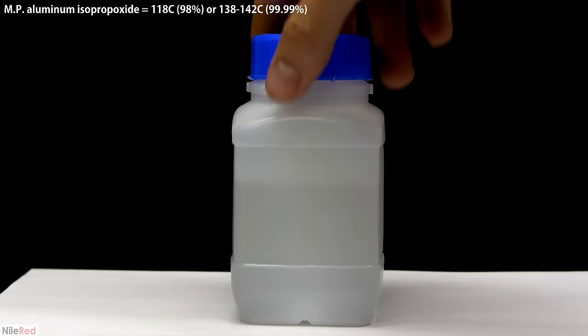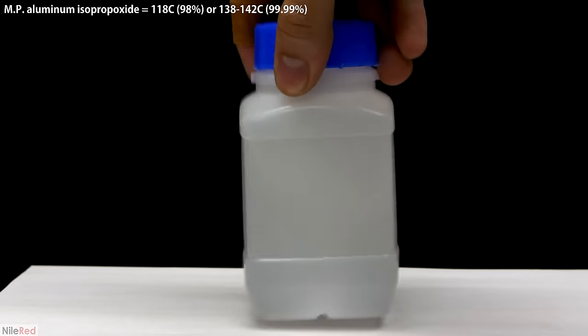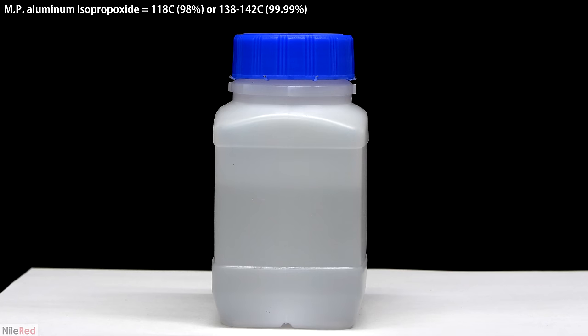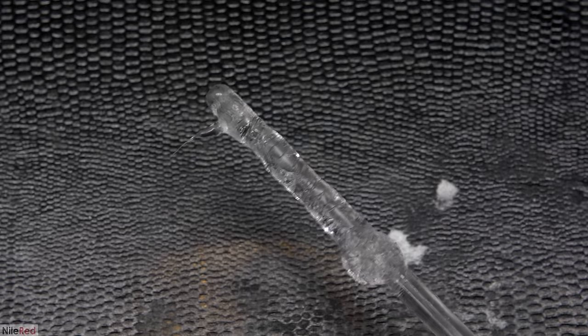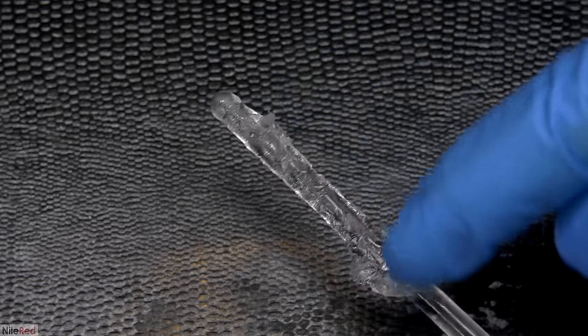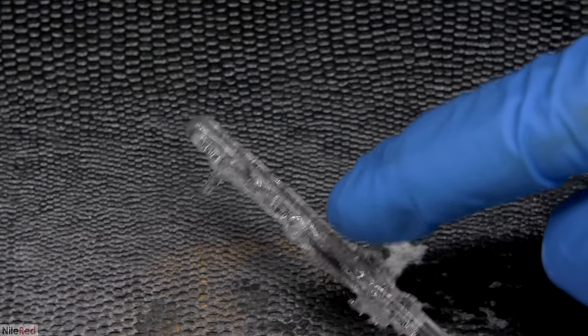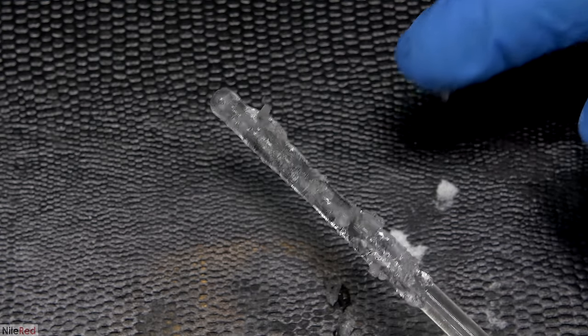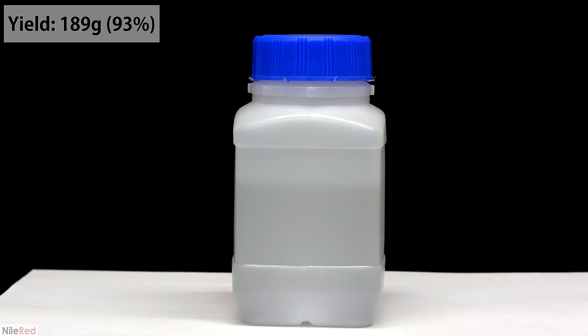Aluminum isopropoxide has a big tendency to supercool. So even though it's cooled down to room temperature, which is below its freezing point, we still have a liquid instead of a solid. When I dip a stir rod into the liquid and pull it out, the aluminum isopropoxide immediately starts to solidify. It still has a little trouble, so it doesn't become completely solid but instead becomes more of a gel. The final yield was about 189 grams, which corresponds to a percent yield of 93%.